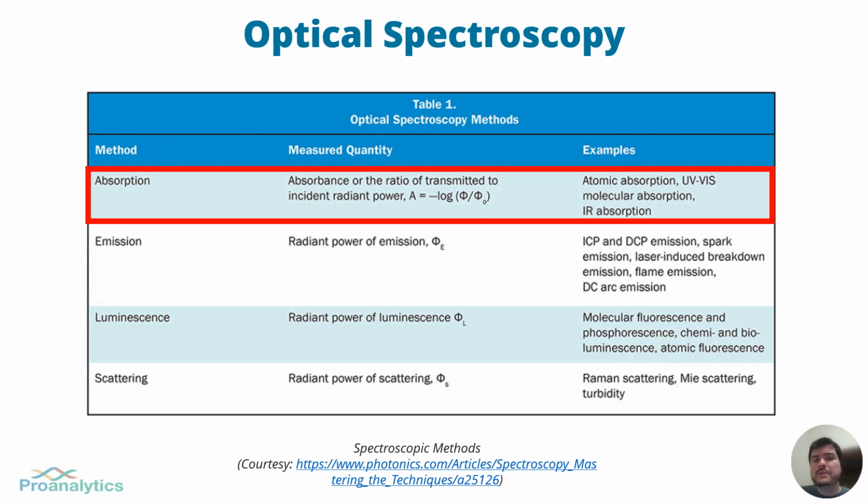Another common method of absorption spectroscopy is UV-Vis spectroscopy. UV-Vis spectroscopy utilizes the ultraviolet and visible ranges of the light spectrum, which typically consists of the 200 nanometers to 800 nanometers range of the spectrum. The molecule of concern changes electronic energy states due to the absorption of light within the UV-Vis range of the spectrum. For the absorption to happen, the energy of the incident light must match the energy of a possible transition between electronic states of the molecule.